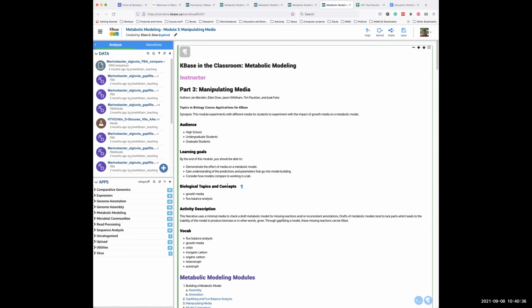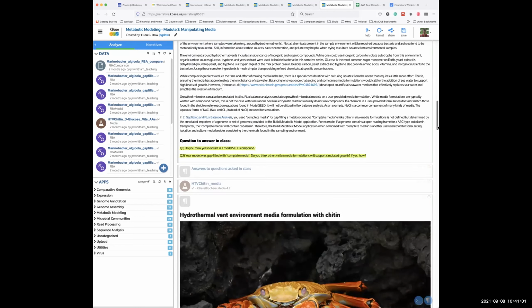And we actually found one organism that was unique enough that it was worth getting. We had nanopore sequence data, we got the Illumina sequence data, and we're able to assemble a professional quality map just from that data. And so the students were pretty excited about that, and that they had found a novel organism from deep sea ocean vents. So we went from there.